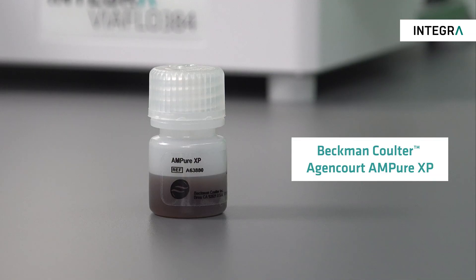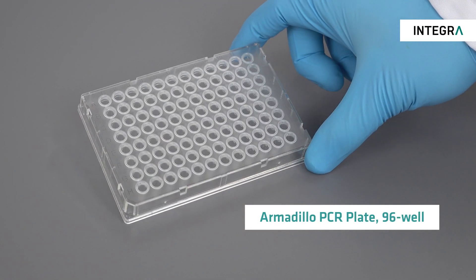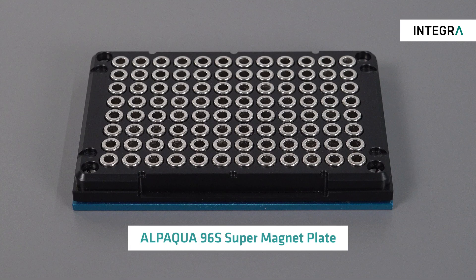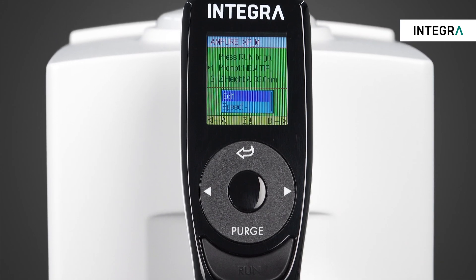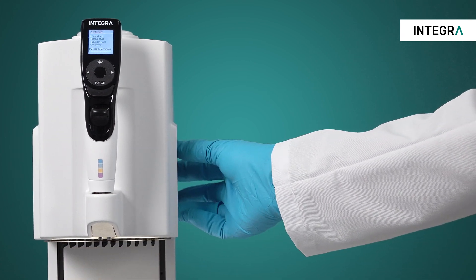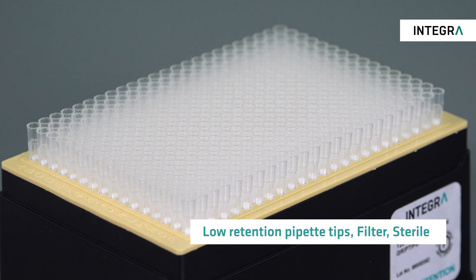To start the process of using the VIAFLOW 96 electronic pipette together with magnetic beads you need to have the following ready: magnetic beads — for this protocol we are using MPUXP beads; samples — a 96-well plate filled in each well with 10µL of samples to be purified; a 96-well ring magnet with a standard plate footprint; 70% ethanol as well as the elution buffer. We'll be using the VIAFLOW 96/384 base unit together with a 96-channel head with a volume range of 5 to 125µL, the 3-positioning stage, and low retention sterile filter tips.